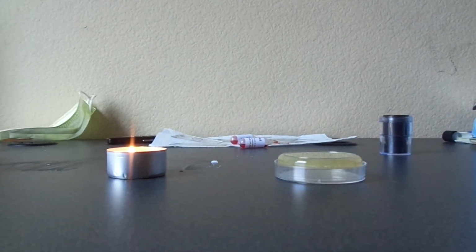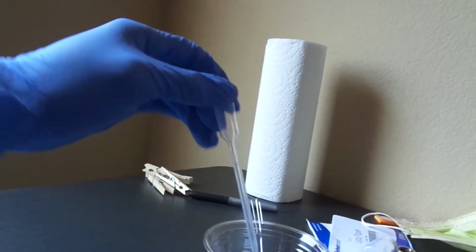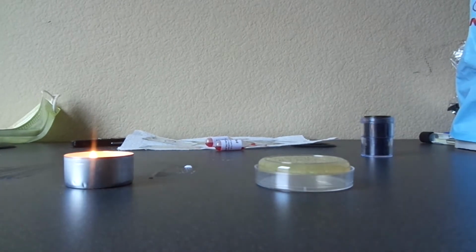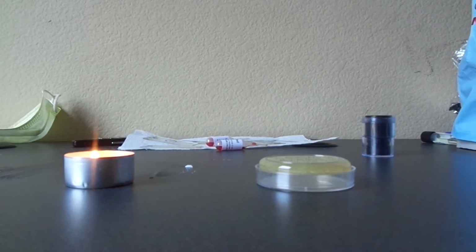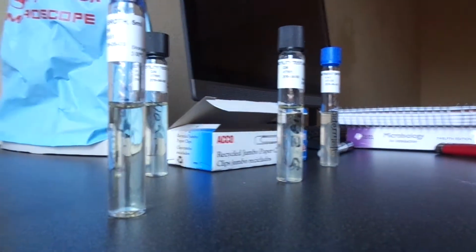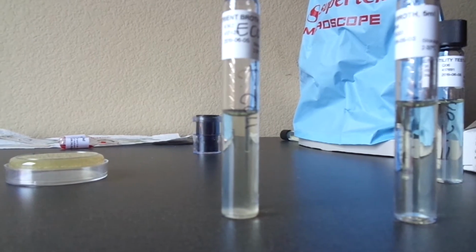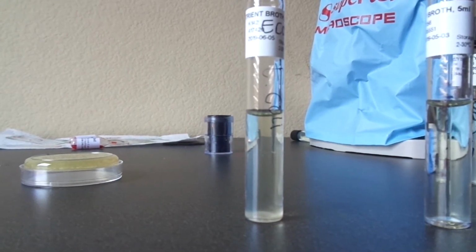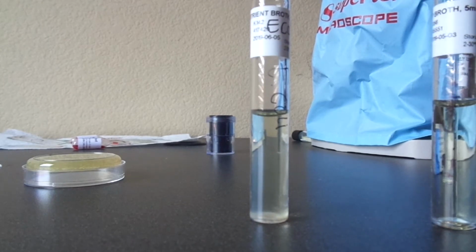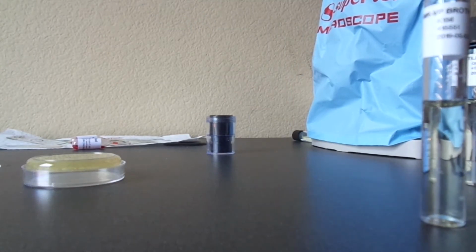Okay, so the first one, I have my alcohol here. I'm going to make sure that's sterile. It's very important that these are labeled too, just so we know which is which, because this is an identification lab. So I'm going to do the E. coli, and I'm going to inoculate it into the MRVP broth. I'm going to remove the cap, flame it.